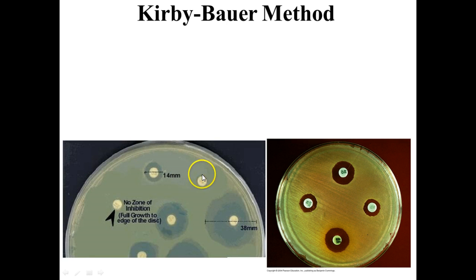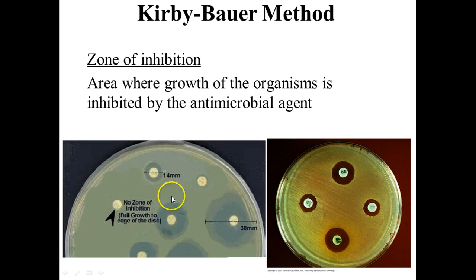Now here, notice, actually here, no inhibition of growth at all, right? It's clearly resistant to that antibiotic, right? You definitely would not give that one to your patient. The others you'd have to measure and compare to the table, right? So these clearing zones are zones of inhibition.